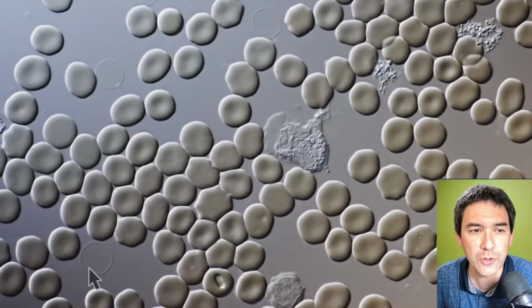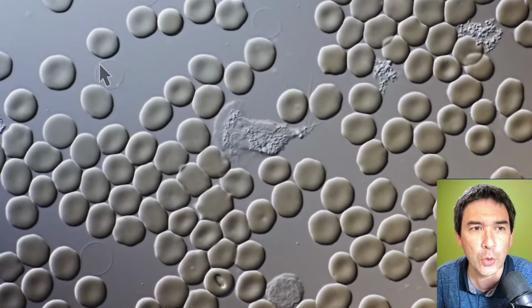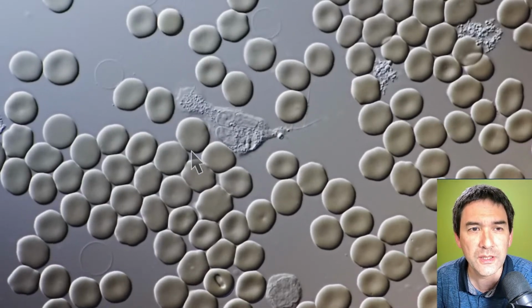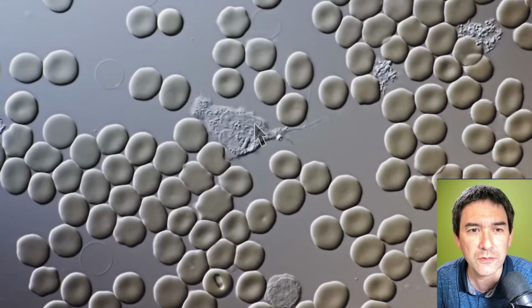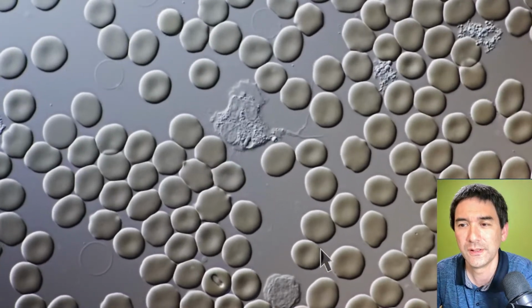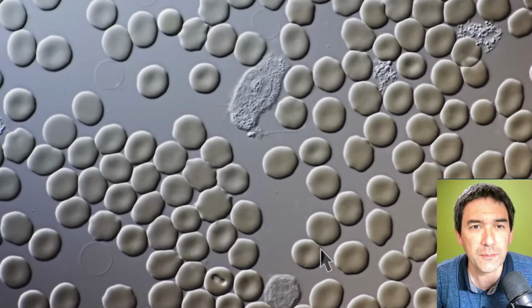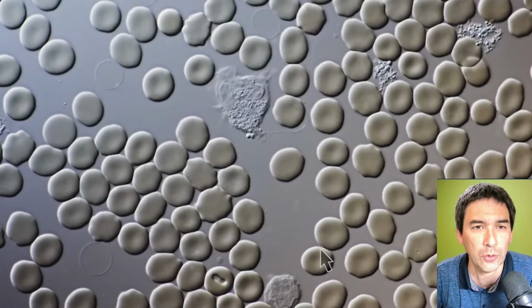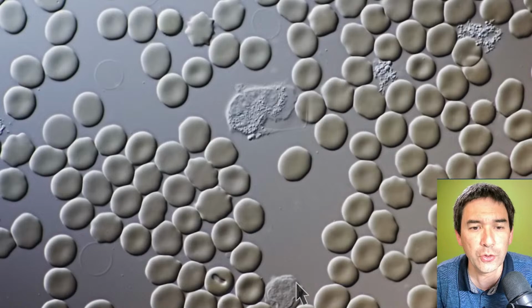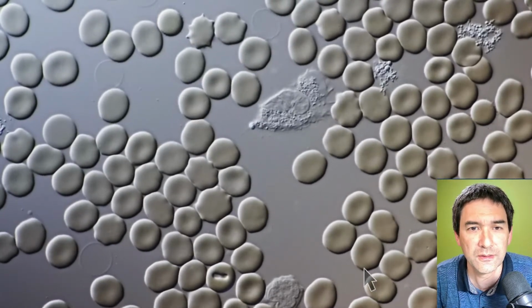This one over here is called a ghost. It's a red blood cell that popped open and lost its contents, also up here. Barely visible. And you see that it's kind of moving around like an amoeba. This is actually quite fascinating to see. This is something where you have to be really patient. The video is actually quite long, and then I went into time lapse and sped it up. You see that not all white blood cells are moving around. The one down here, for example, is just sitting, because they're different white blood cells.